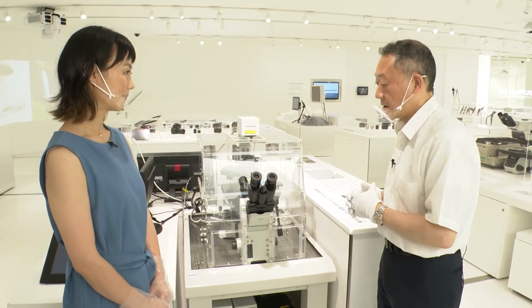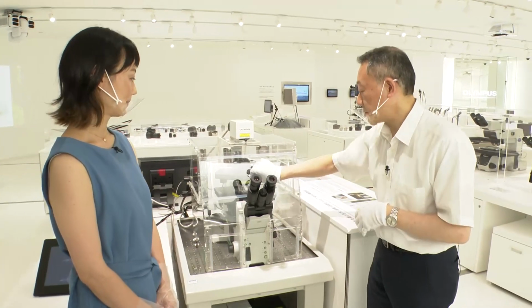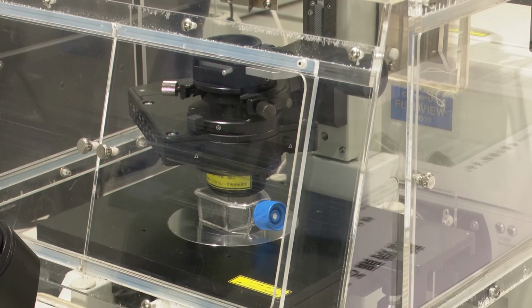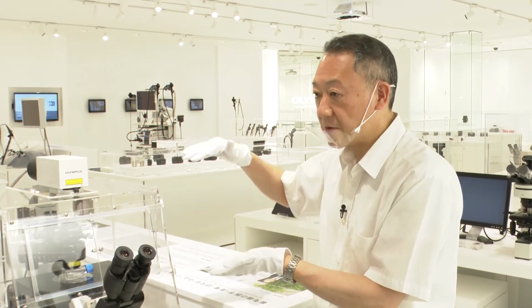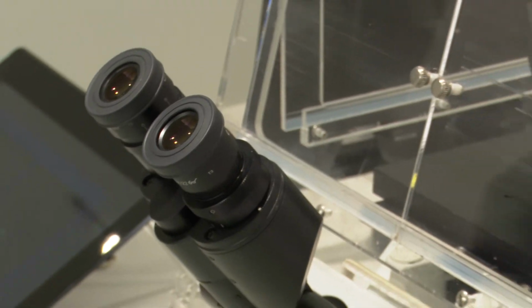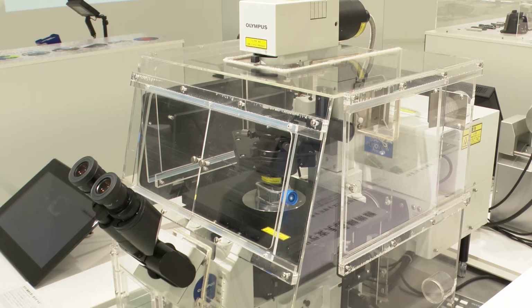In the time period of the microscopes you saw earlier, samples had to be observed one by one. But in recent research, what's called a culture liquid with cells are put in what is then kept at a stable temperature inside an insulation case to sequentially observe the process of change. It makes it possible to see how things develop throughout the process, and this microscope is often used for that kind of research. That's impressive.